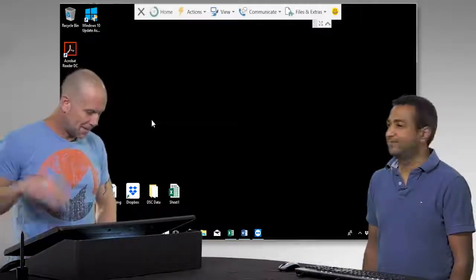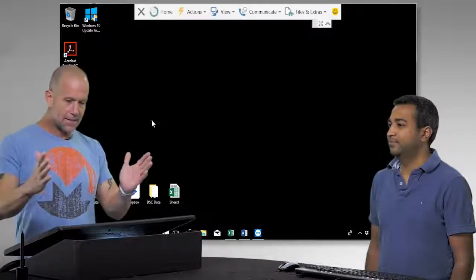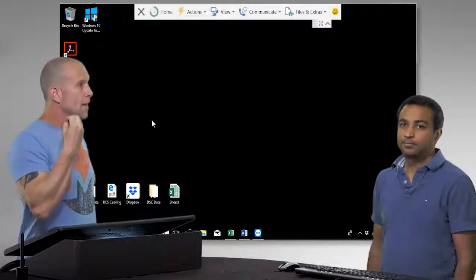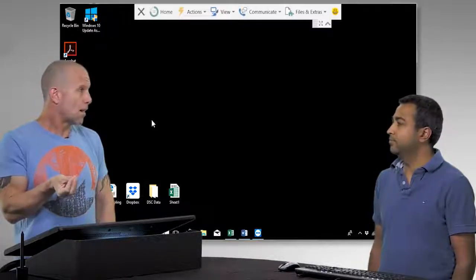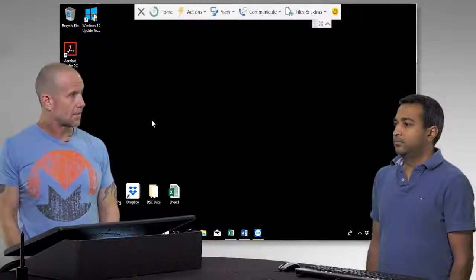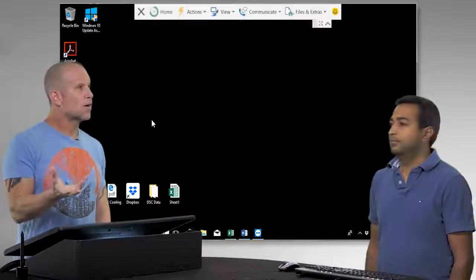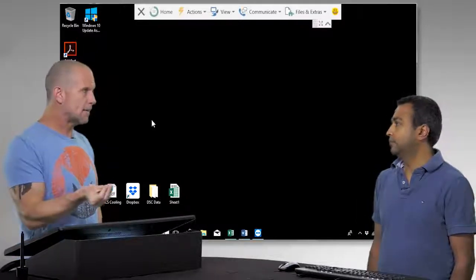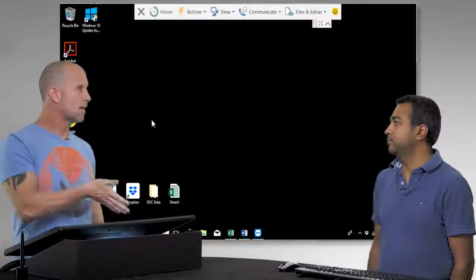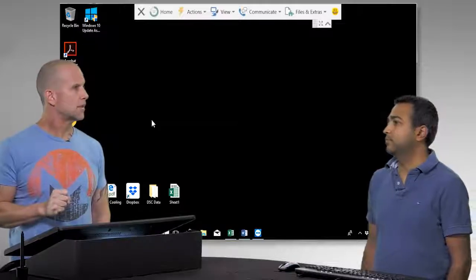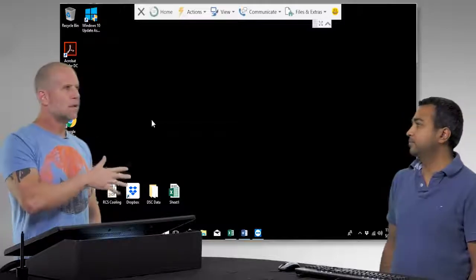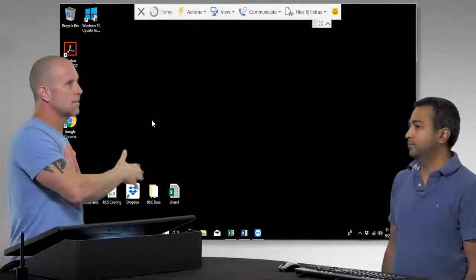We're sitting outside of where the DSC is, but this is exactly the computer window screen we would see if the computer was booted into the general account that anyone can collect data on. The software used to both collect and analyze data is Trios, which runs only on Windows — any modern Windows as well as some legacy versions.